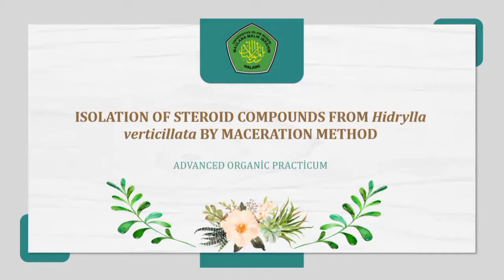In this presentation, we will discuss the isolation of steroid compounds from Hydrilla verticillata by the maceration method. But before that, I will introduce my group.